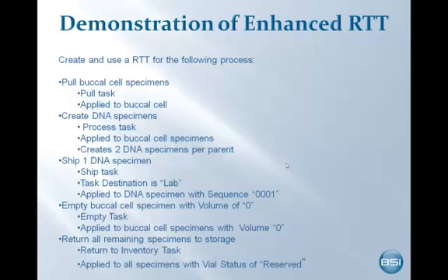Below is an example process that I have created a template for. Under each step, I have listed the task type and the specimens to which the task will automatically apply, as well as any default task properties.